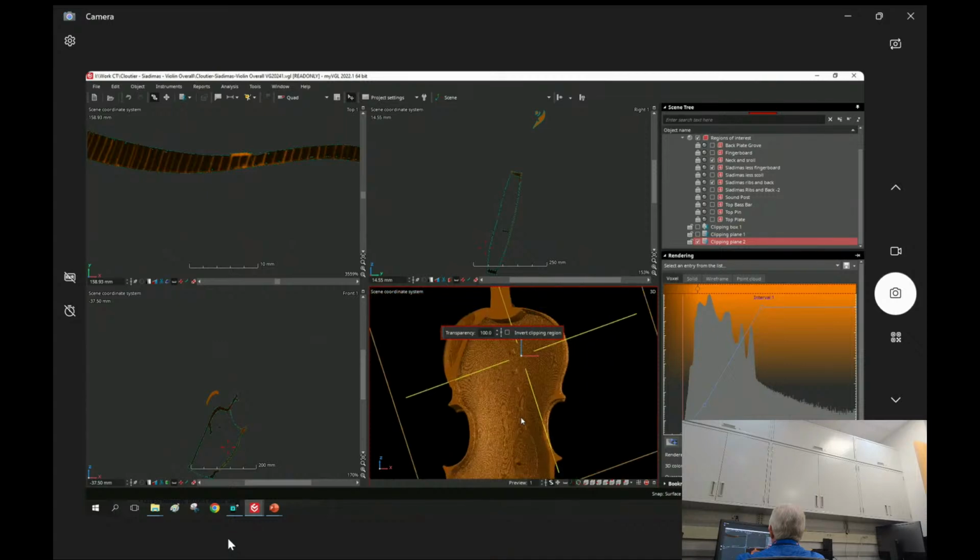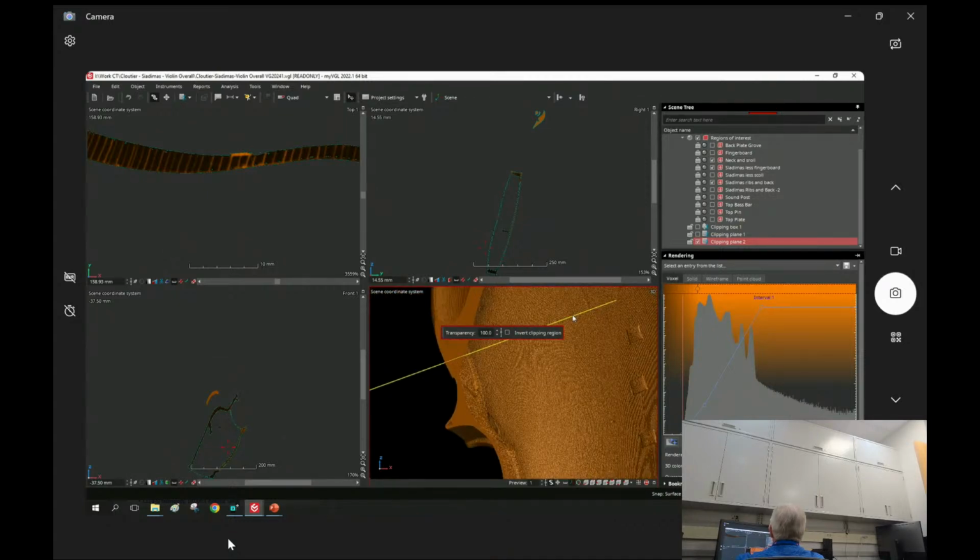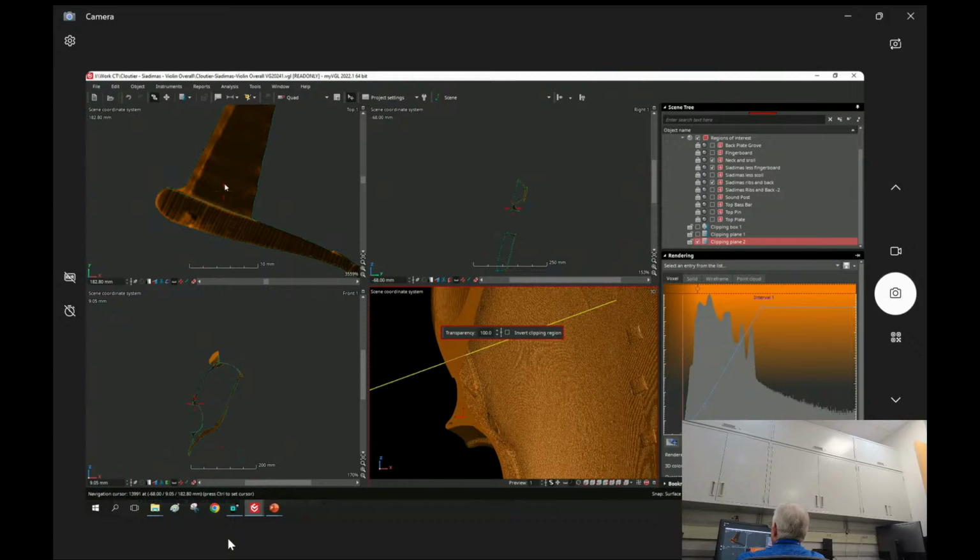And we can see things like wood grains, which I'm not seeing with that so much, but I can see over here. So this is a brace in between the outer edge and parts of the body, so now bring this over a little bit, scroll through.